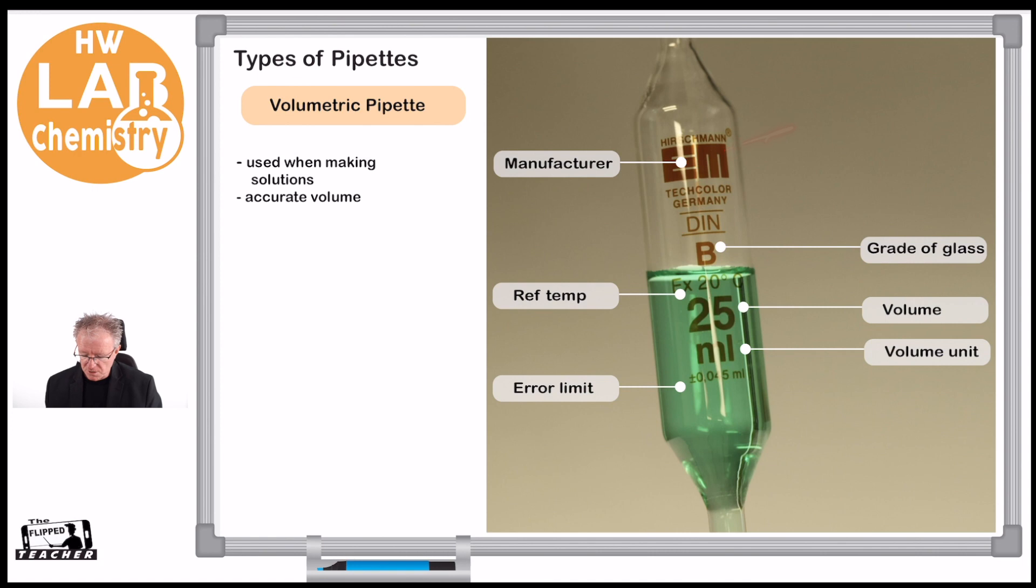We have the manufacturer at the top there, the grade of glass, the actual volume, and then the units it's measured in. So it's a volumetric pipette used to make up solutions.